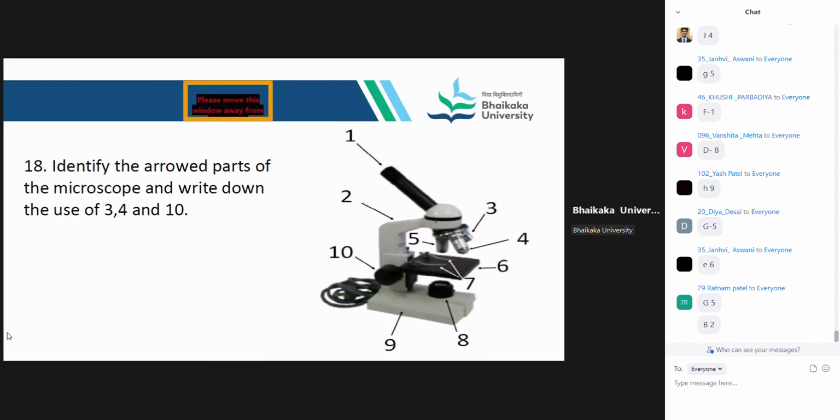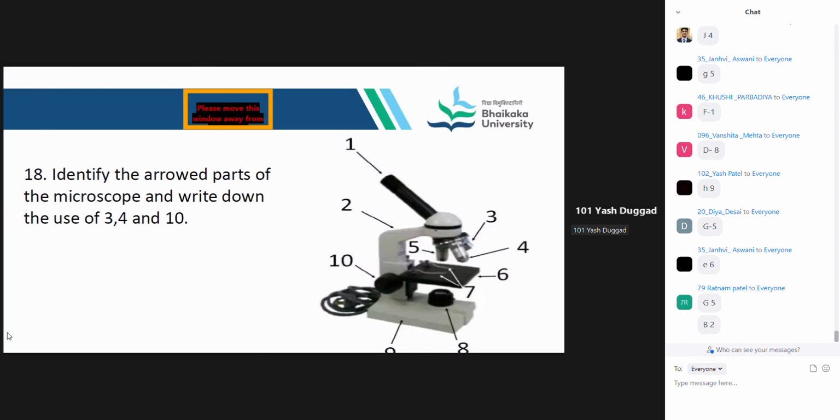In the journal, you put down the answers to the questions, because we learn in detail. You will be able to put down the answers, and even label the microscope parts properly. So we go ahead with 2 more questions.